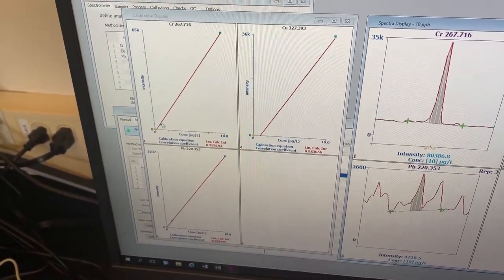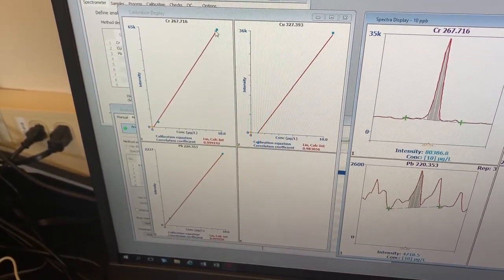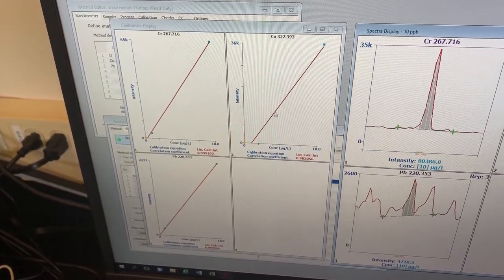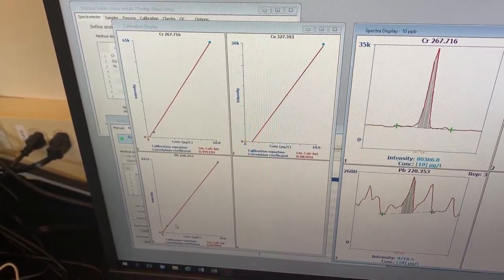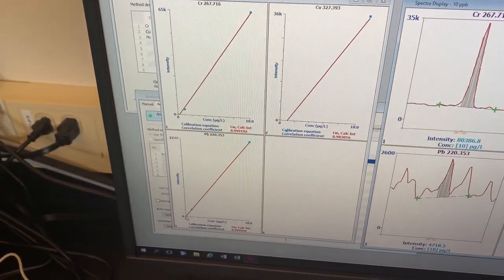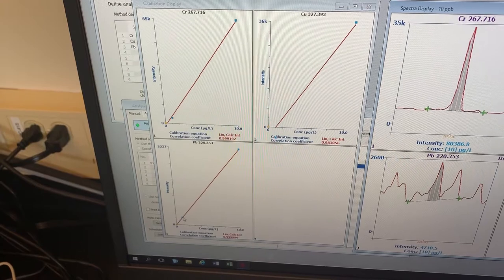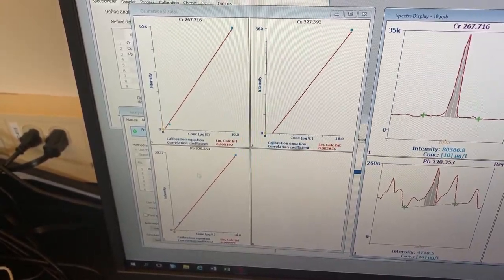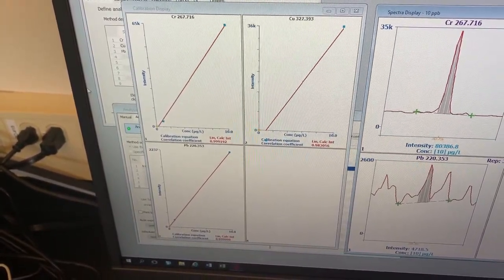So here's our chrome calibration with three. So there's our zero or our blank. Here's our one ppb. And here's our 10 ppb. Here's calibration for copper. And here's calibration for lead, which looks really good today. So zero counts at zero intensities. And then here at one ppb, we have higher intensity. And here at 10 ppb, we have even more.